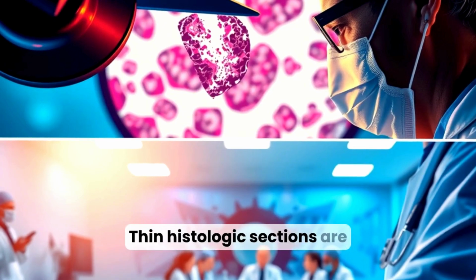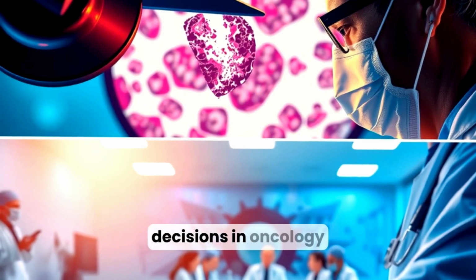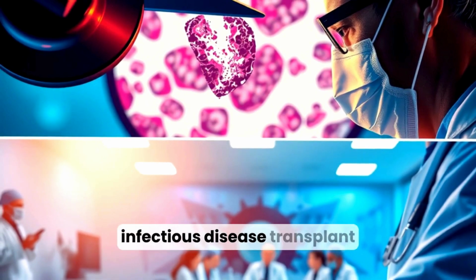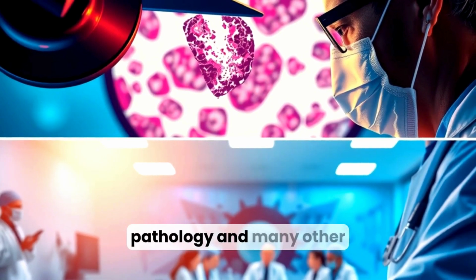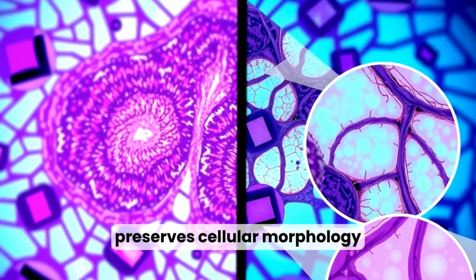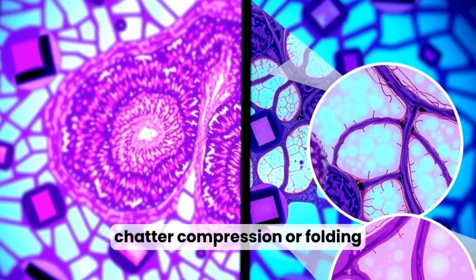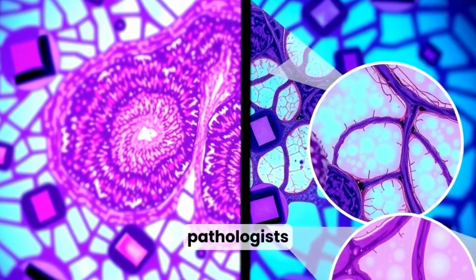Thin histologic sections are foundational in clinical diagnosis, guiding treatment decisions in oncology, infectious disease, transplant pathology, and many other specialties. High-quality sectioning preserves cellular morphology and prevents artifacts like chatter, compression, or folding that could mislead pathologists.